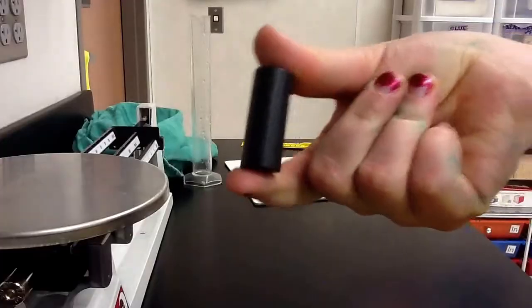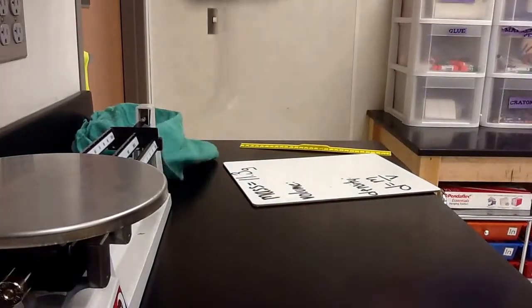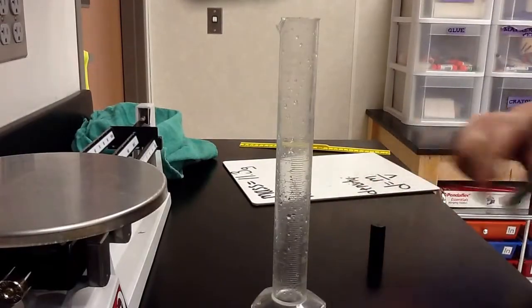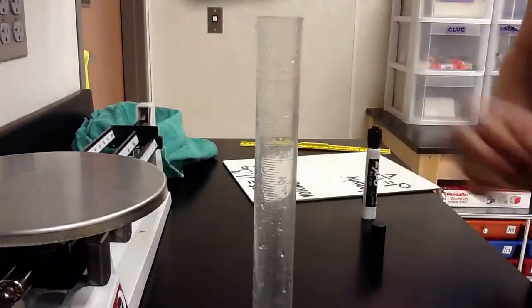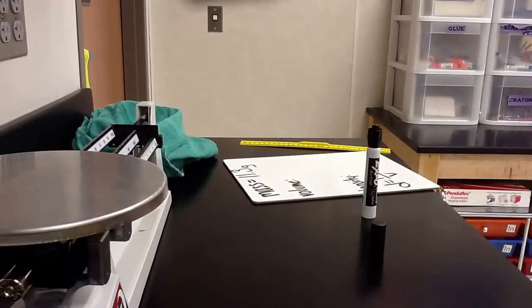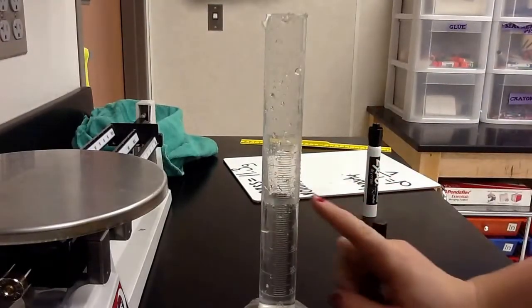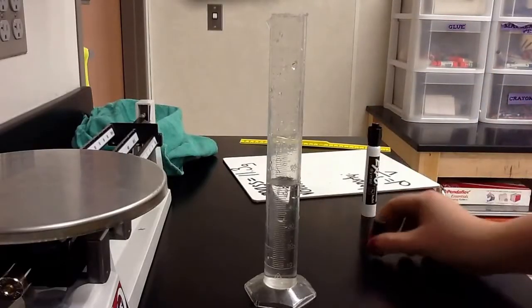For an irregular solid like this, to find volume, we do volume by displacement. To do volume by displacement, we use a graduated cylinder. This graduated cylinder goes up by 1 milliliter. It's always good to know what your graduated cylinder goes up by so that you can count your volume correctly. So first thing you have to do is fill it with water. It doesn't matter where you fill it up, as long as when you put the object in, it's not going to go above your top line and it completely covers your object.